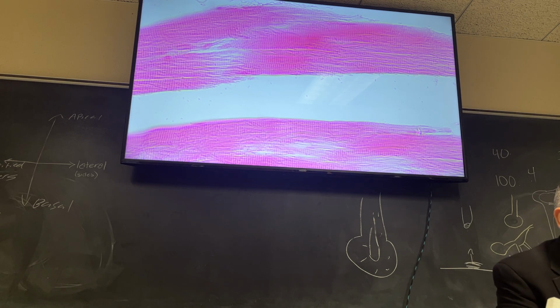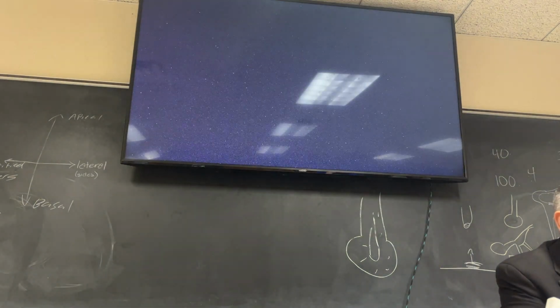Our picture doesn't really have them towards the edge. You did what now? Our picture, the mitochondria and the nuclei, it doesn't really have both of them near the edge. It has one of them sort of near the edge, but... Well, let me go back one second. No, I was going to just say this actually.